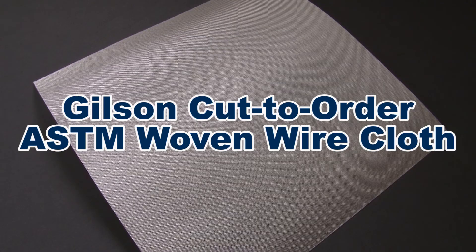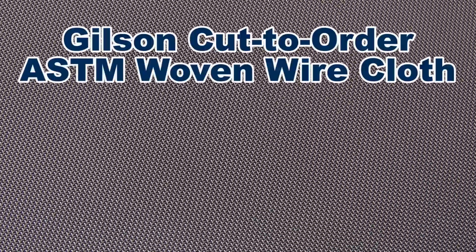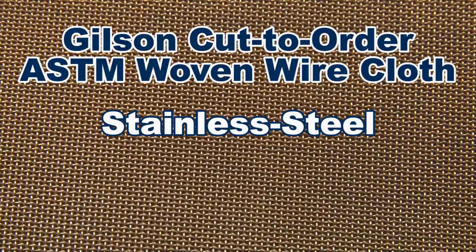ASTM cut-to-order wire cloth complies with ASTM E11 and AASHTO M92 requirements and is the same high-quality mesh used in Gilson test sieves and screen trays, and comes in either stainless steel or brass.